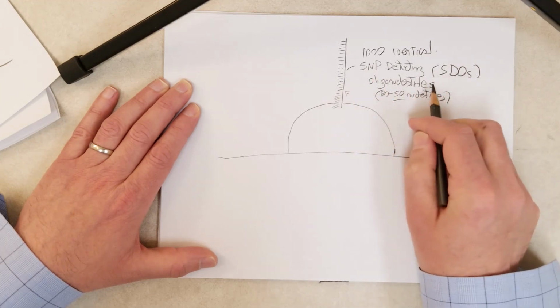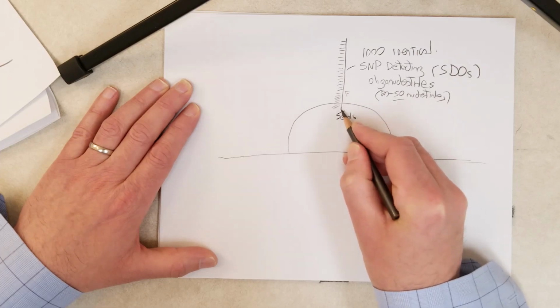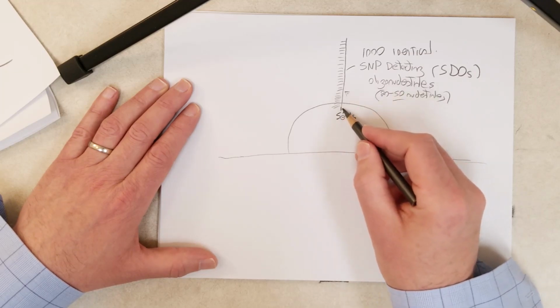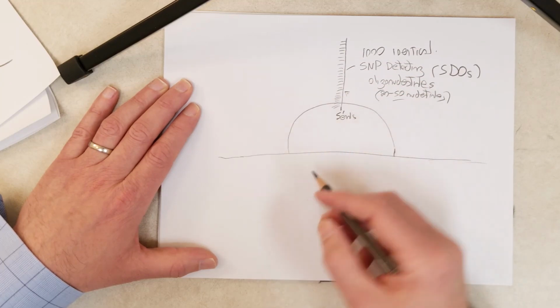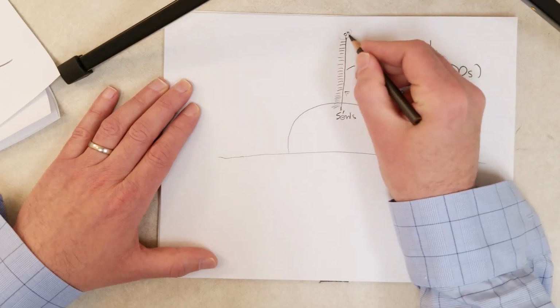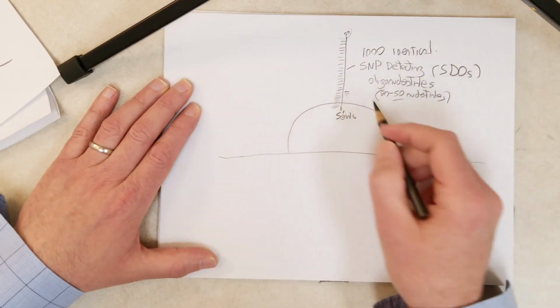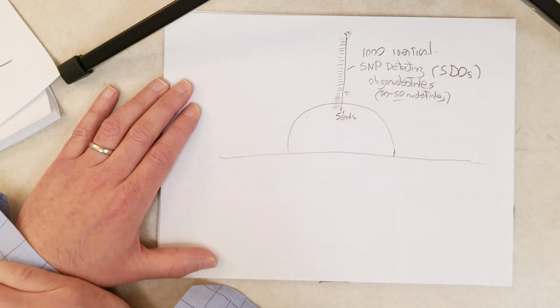SNP detecting oligonucleotides. So the 5' ends, it's a DNA strand, so there's a 5' end and a 3' end. This is the 5' end, and the 5' ends of these 1,000 identical oligonucleotides are attached to the bead. And the 3' ends, which end with an OH group, right? 3' OH group, those are all free. And if this is a solution of water or buffer over these beads, these will be floating in the solution, attached to the beads at the 5' ends.